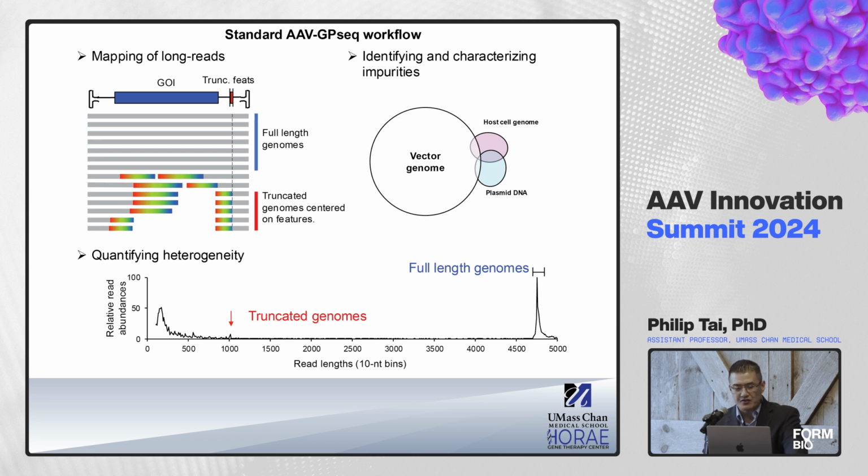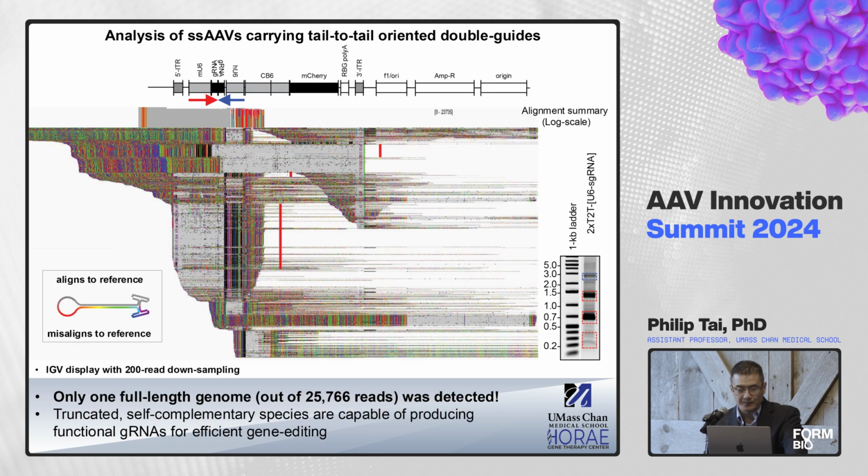And so, yeah, this is just an example of identification of truncation hotspots, where if we know that the majority of the sequences are full length and we run standard gels and you see that there's one band, these sequencing technologies have the resolution to identify these truncation hotspots. So this is a worst-case scenario.